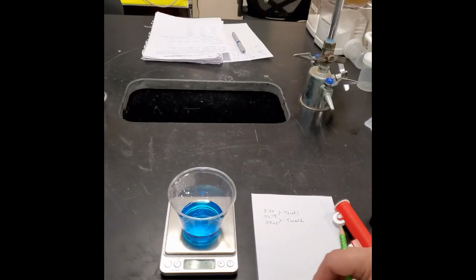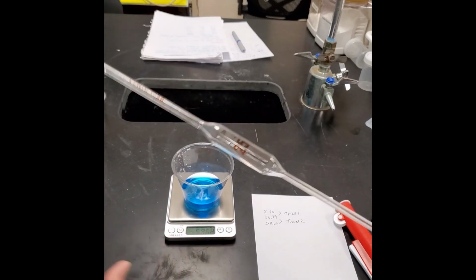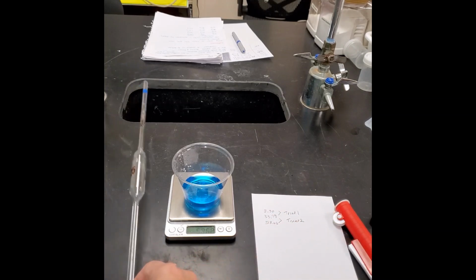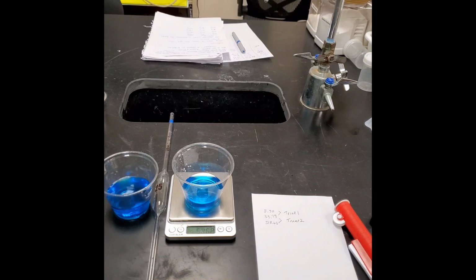Okay? So if I put it on the counter right here near the edge, it potentially can roll off if you don't put anything in front of it. Ideally, you always want to put it perpendicular to the counter, so if it rolls, it doesn't roll off the counter, and then just put something next to it so that it can't go anywhere and it can't roll.